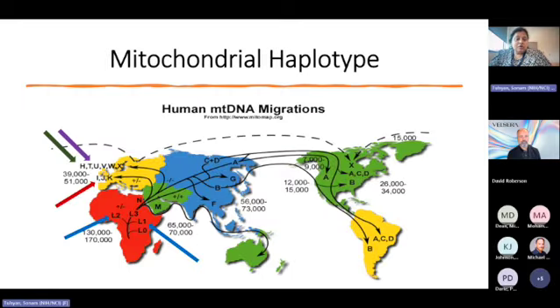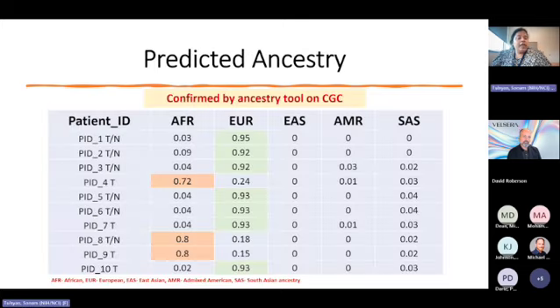We also predicted the haplotype by using the MitoMap software, and we found that 7 of our 10 samples have Caucasian ancestry, and this was confirmed by the predicted haplotypes H, T, and I. 3 out of 10 samples have African ancestry, which was confirmed by the L1 and L2 haplotype groups.